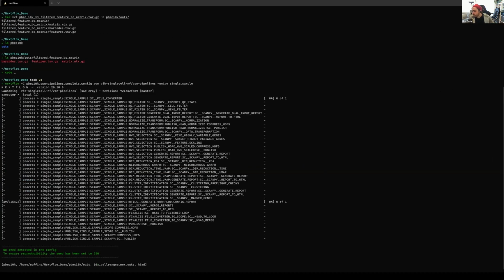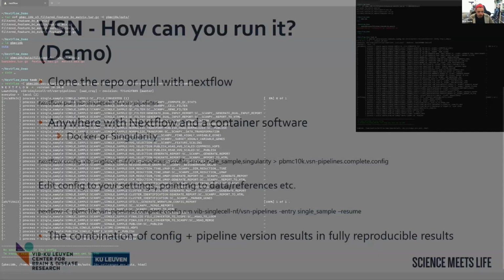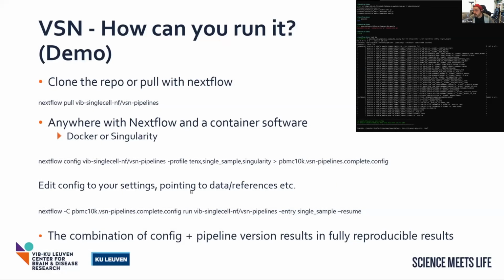Perfect, it started. So with this, I should now be able to do this. Perfect. We're going to leave that going up in the top right-hand corner so you can see it's going live. There's no magic here. And you'll see just how fast it runs. This is, again, for 10K cells on my local computer.